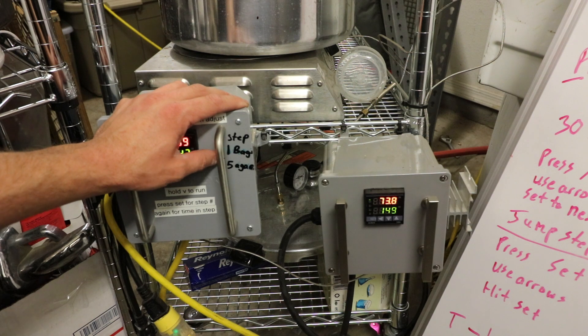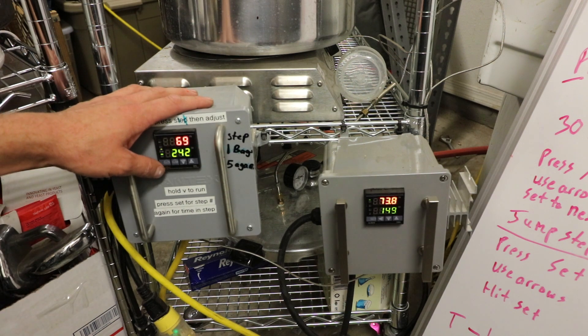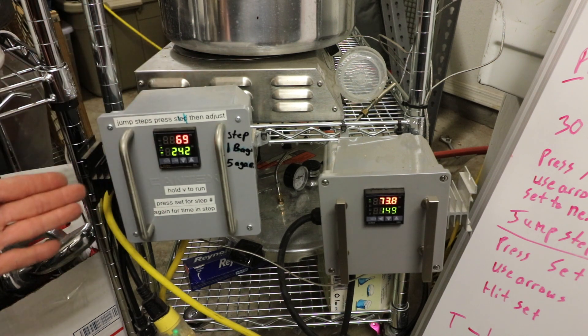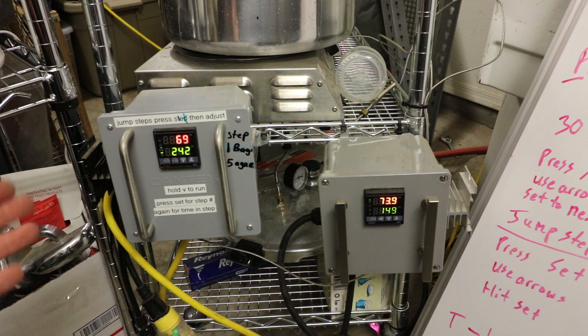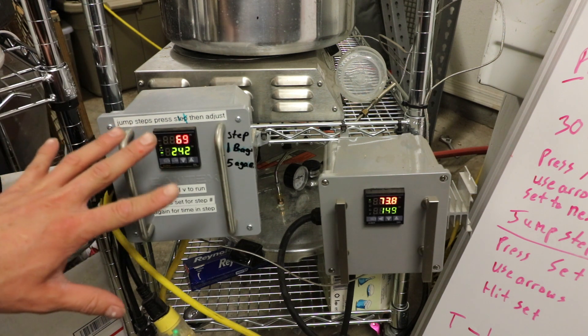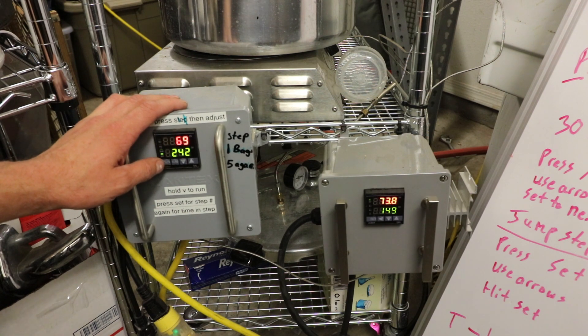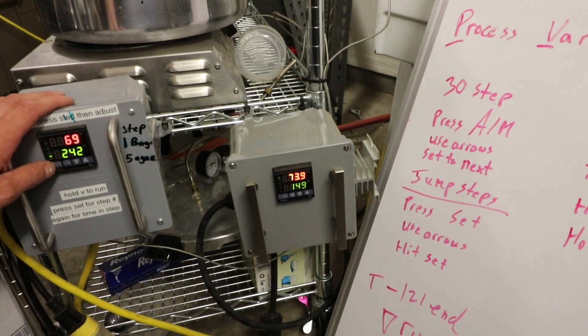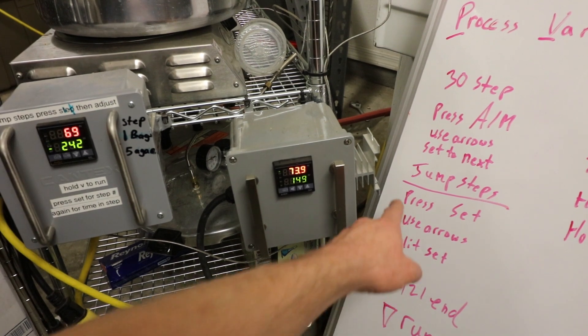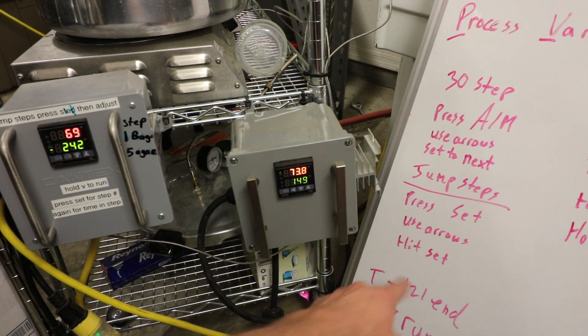So steps one through four is for bags. If I wanted to jump to step one and just do bags, and I'm not doing agar, I don't need to reprogram the whole thing. All I do is I just press set, and then you use the arrows and hit set.